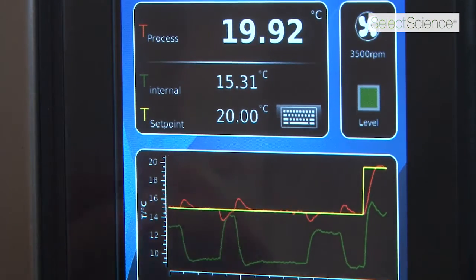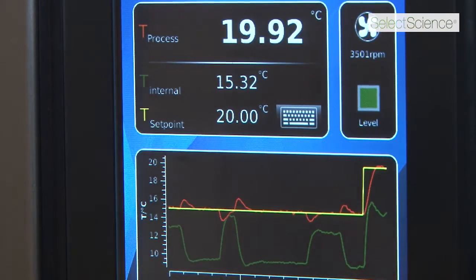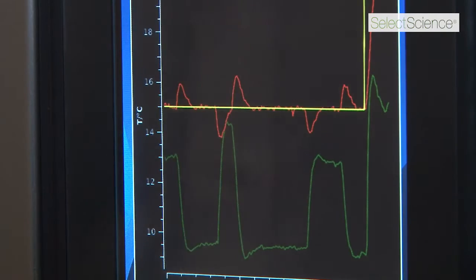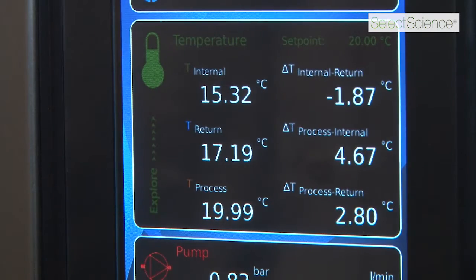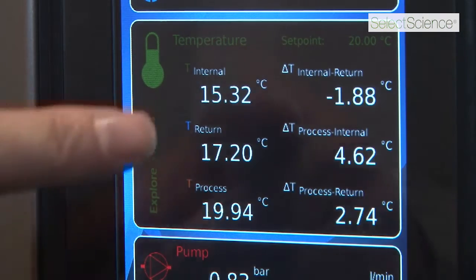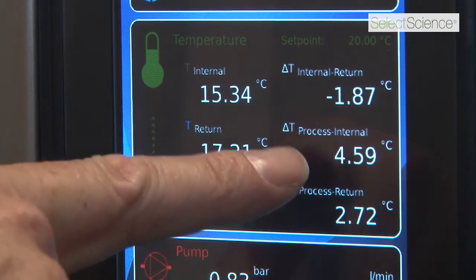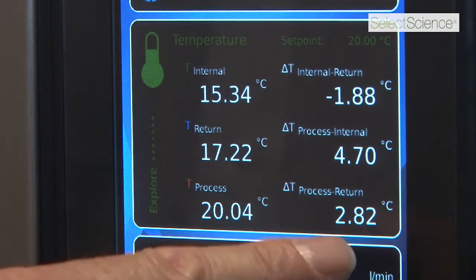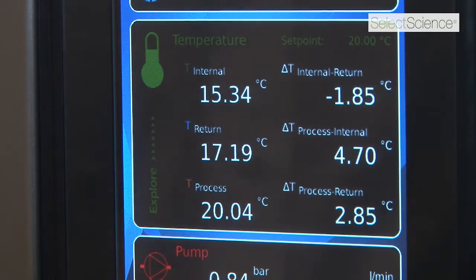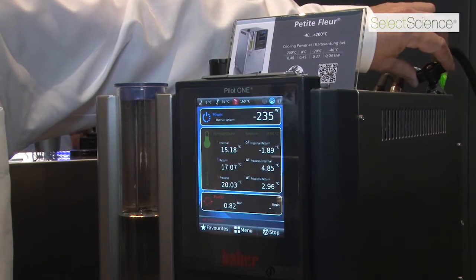The yellow is the set point, the red is the process temperature, and the green is the heat transfer fluid temperature — or if you like, the jacket temperature. I can scroll through the screens to take a closer look at the relationship between those curves. The final screen shows me in a snapshot the differences in temperature between the jacket temperature and the return temperature of the heat transfer fluid, the process temperature and the jacket temperature, and the difference between the process temperature and the temperature of the thermal fluid as it returns to the thermostat. By using a simple ball valve, you can adjust the flow rate of the thermal fluid and see what effect that has on the control of the reaction.